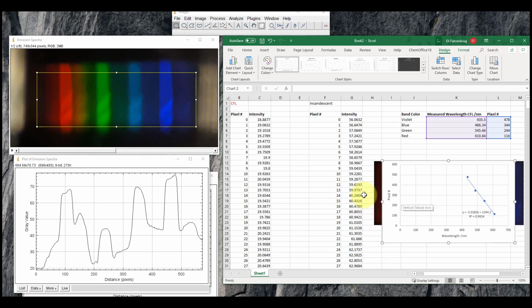If we go back to this rectangle, this yellow rectangle, if I would have drawn this rectangle further to the left, I would have included more pixels, which means that pixel number here would no longer have correlated with the pixel number in the previous set. So that's why it's really important when you process images for data that's collected, you're processing them all together over the exact same pixel range. If you change the pixel range, then you've changed the calibration.